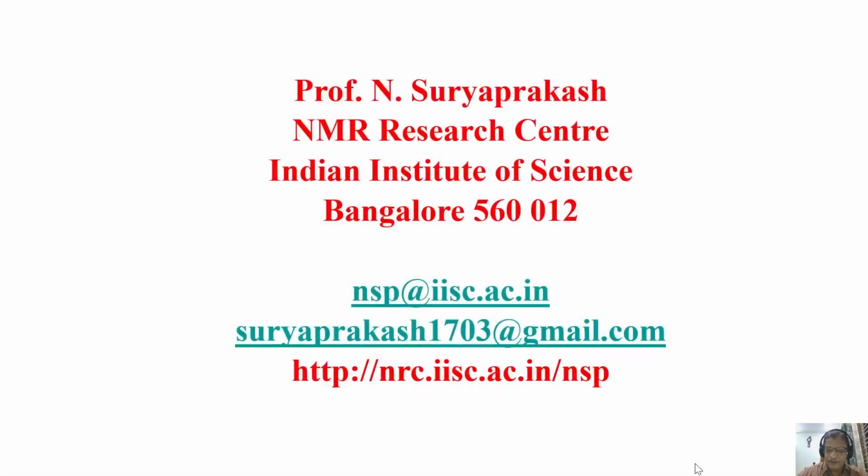Welcome back. In the last class, we started discussion about two-dimensional NMR, where I briefed about the need for two-dimensional NMR and the limitations that are present in the 1D NMR. And I explained what happens if I have a complex molecule with a complex spectra, why 1D is difficult to analyze. I don't say it's impossible. It's difficult to analyze because of the resolution problem, simultaneous detection of two nuclei, and forbidden transitions like multiple quantum, which cannot be detected. So several limitations were there.